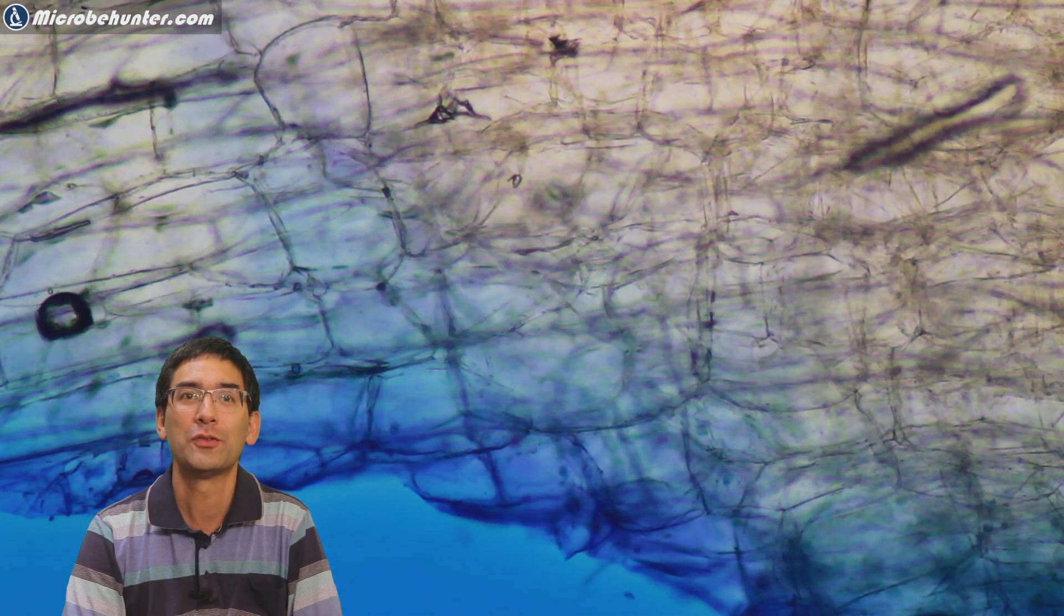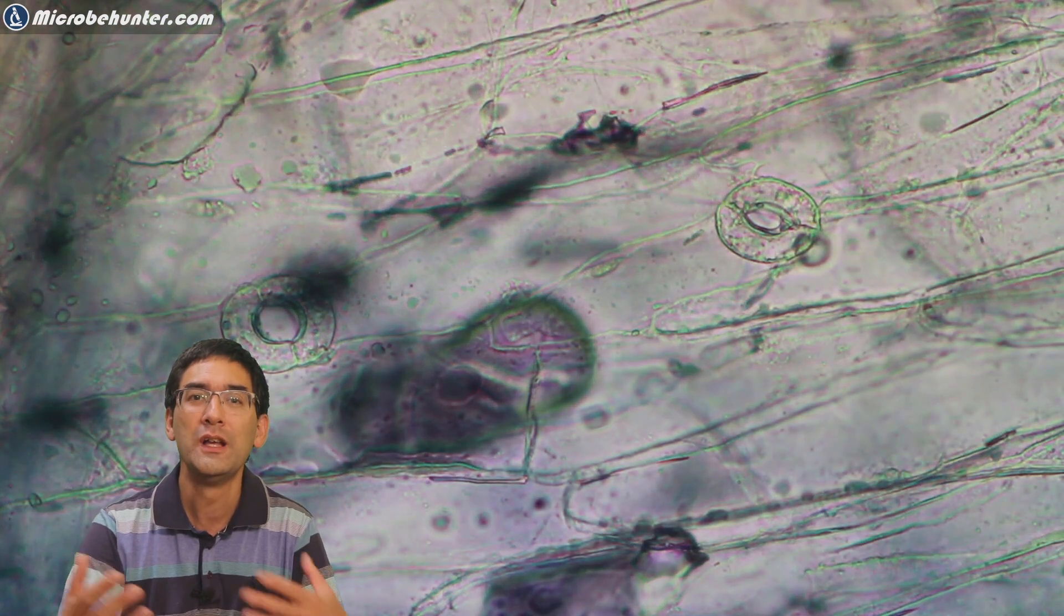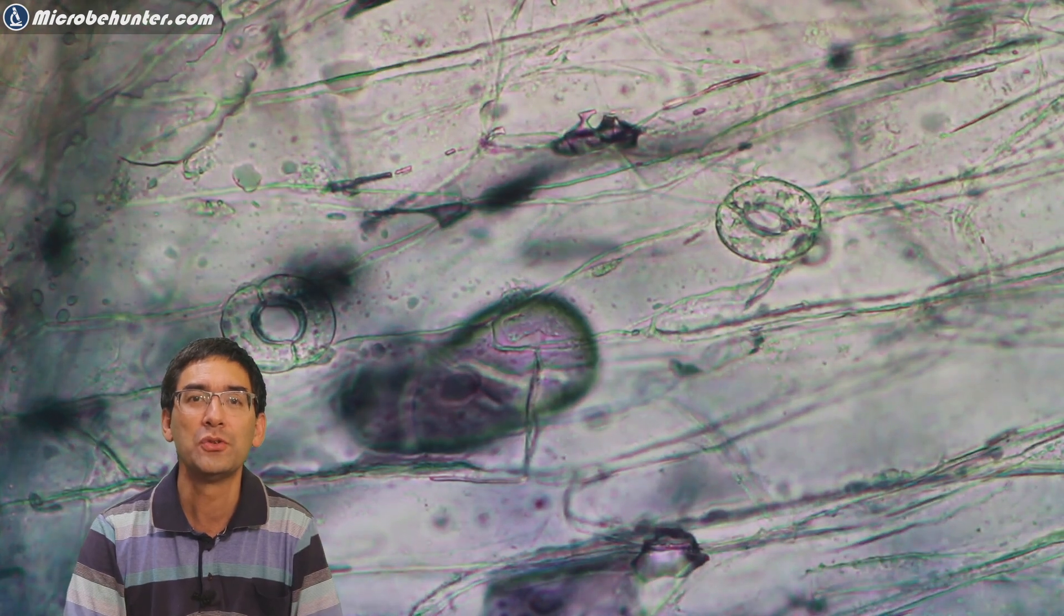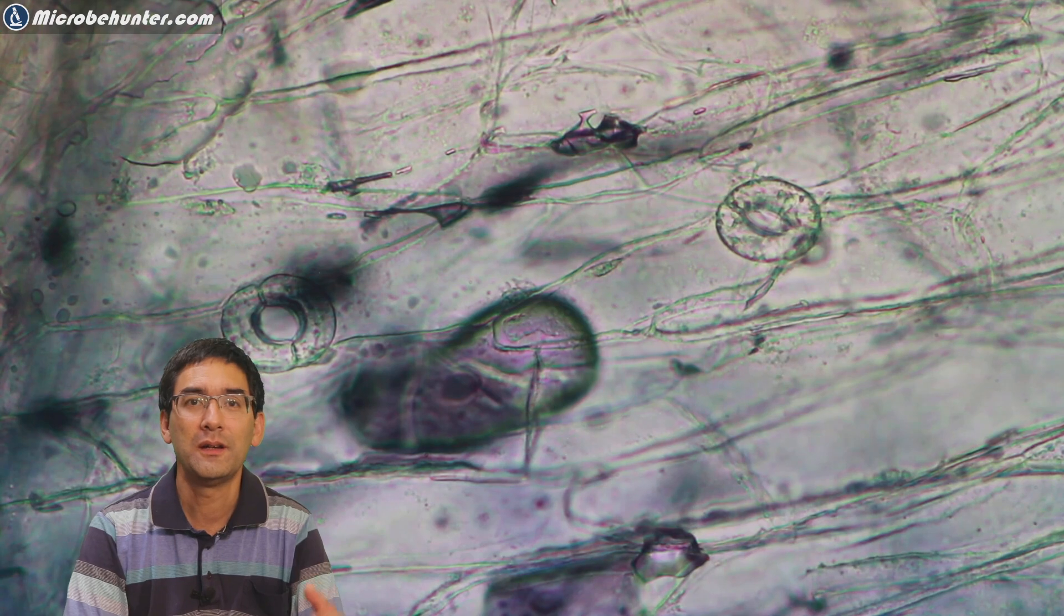If you look carefully you can see them, some of them scattered around. The methylene blue slowly starts to diffuse in and stain the cells. This again increases and improves the contrast. Some parts stain stronger, others less strong, and this allows you to see details that are otherwise not quite easily visible. Here again, a couple of stomates.